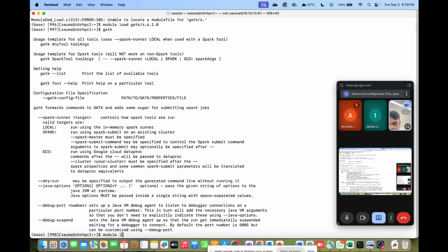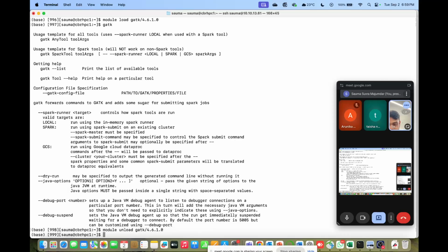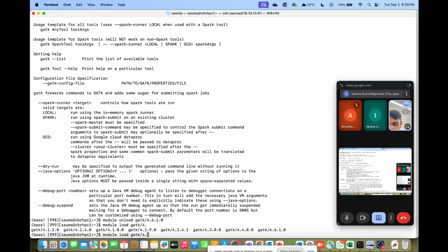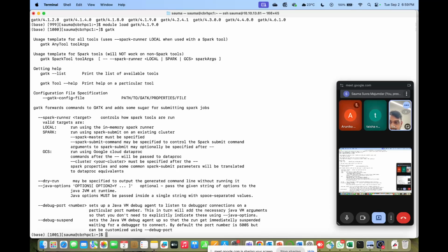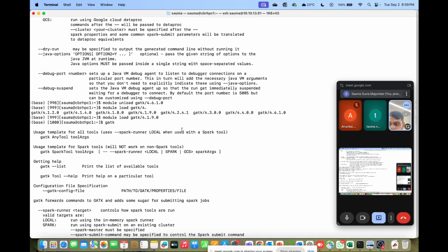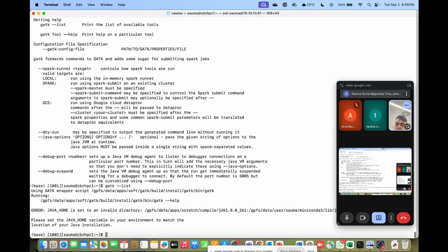The other GATK version will be better, I think. Yeah. Uh-oh. This is not well installed. One second.